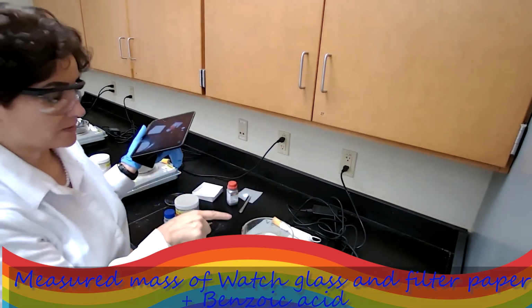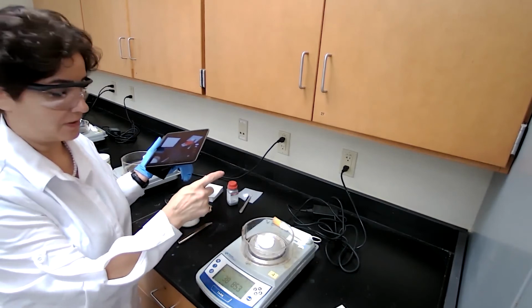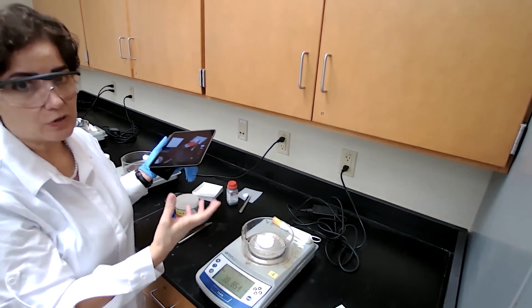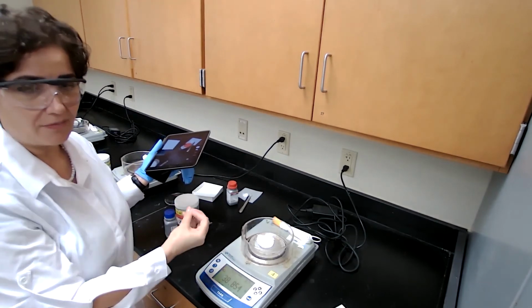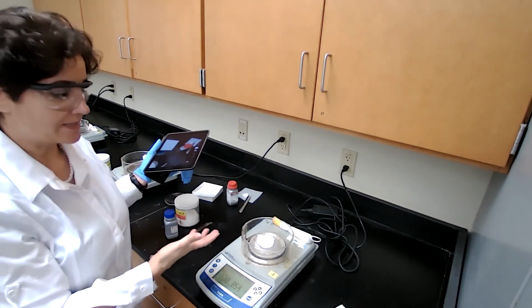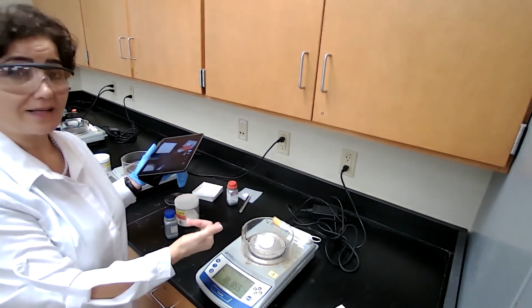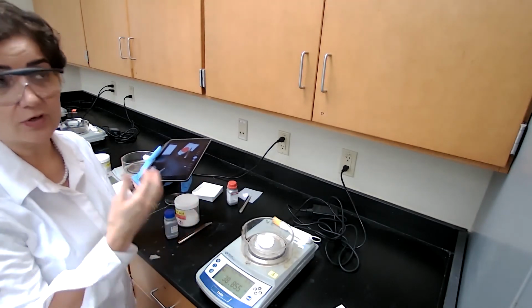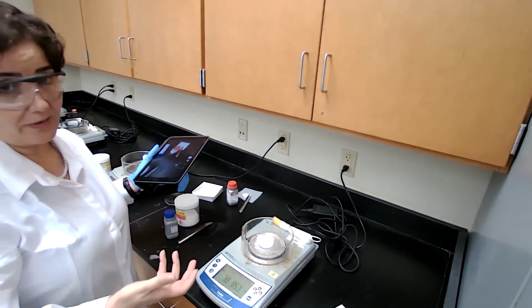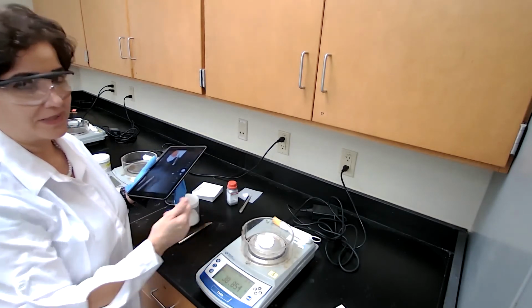Okay, we have the mass of the watch glass, filter paper, plus crystals of organic acid. We had the empty container. When you subtract, you get the mass of the recovered organic acid, which in this case is the benzoic acid. We started with about 0.5 gram. Now, you divide this mass by 0.5, or the exact number that you have reported, times 100, and that would give you the percent recovery of this sample.